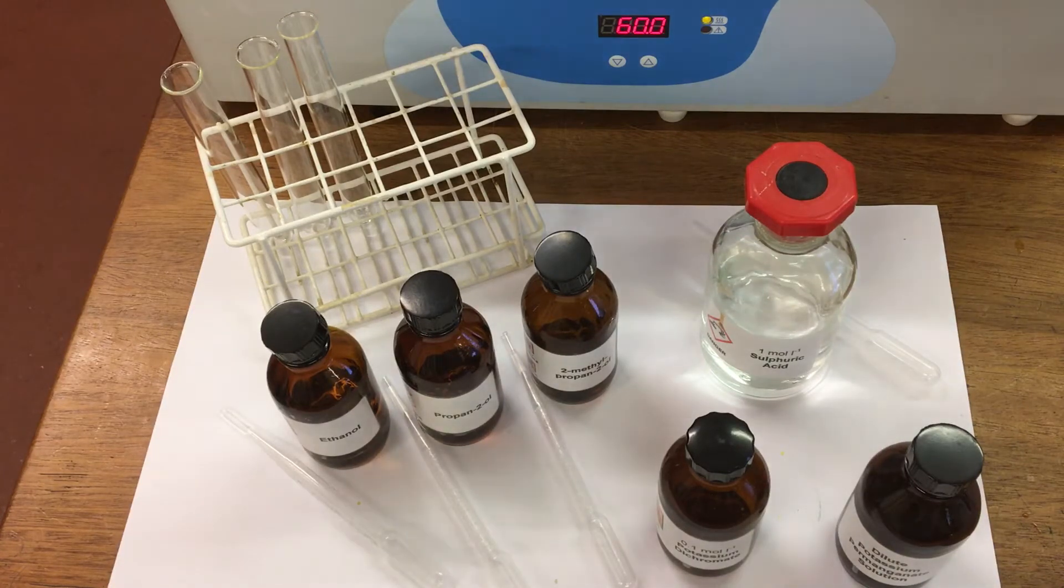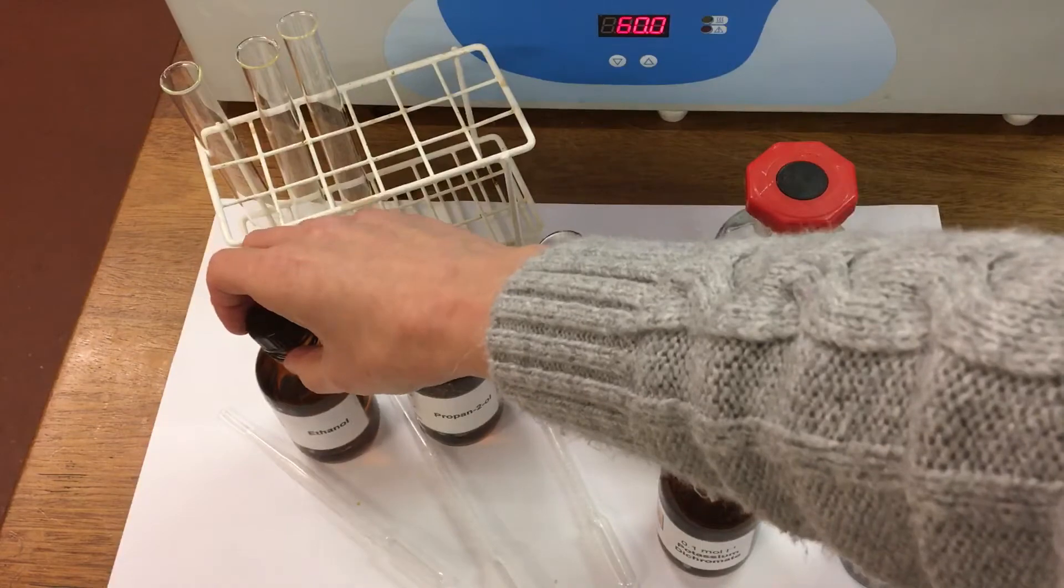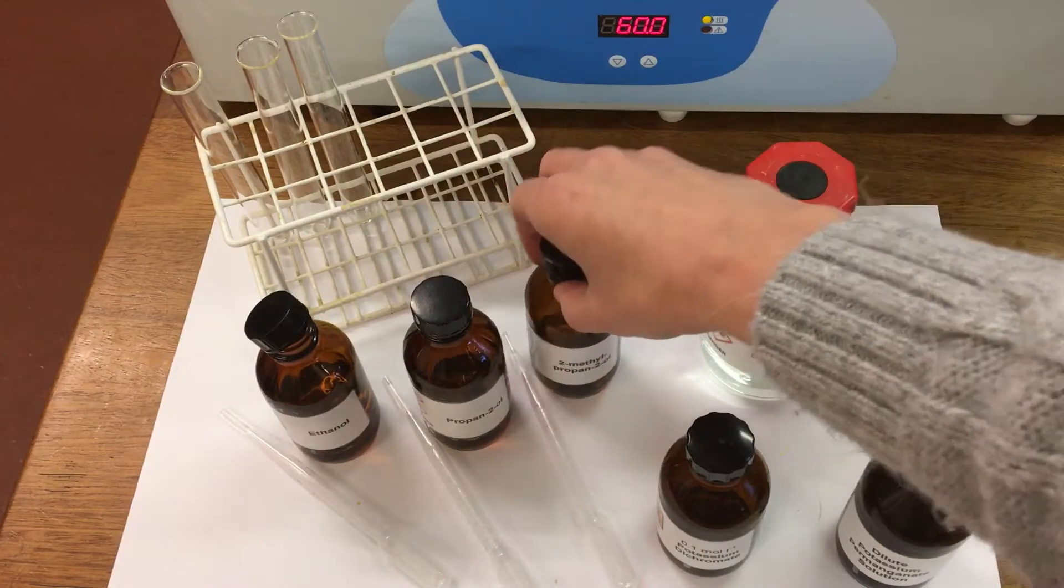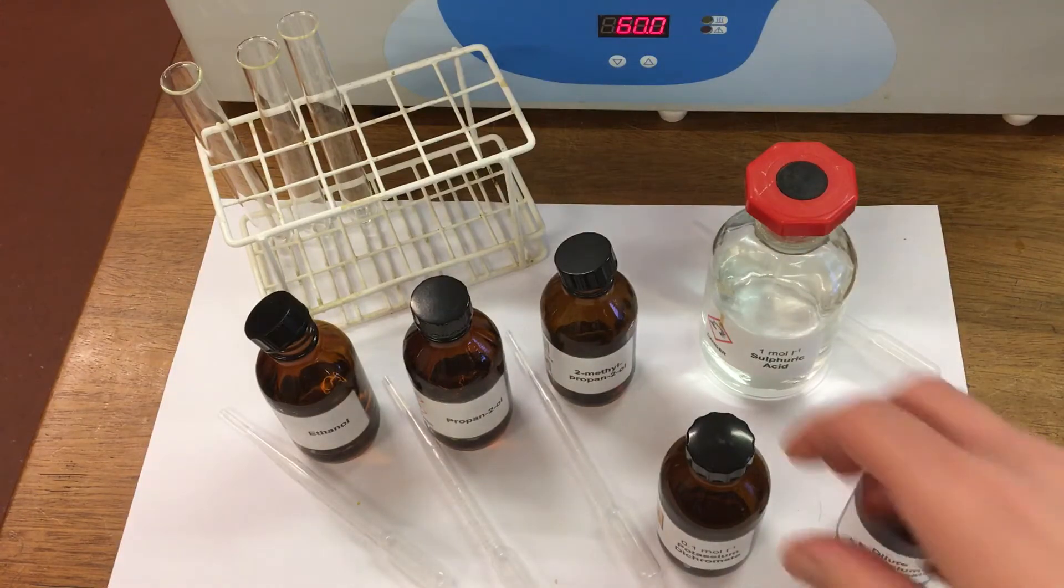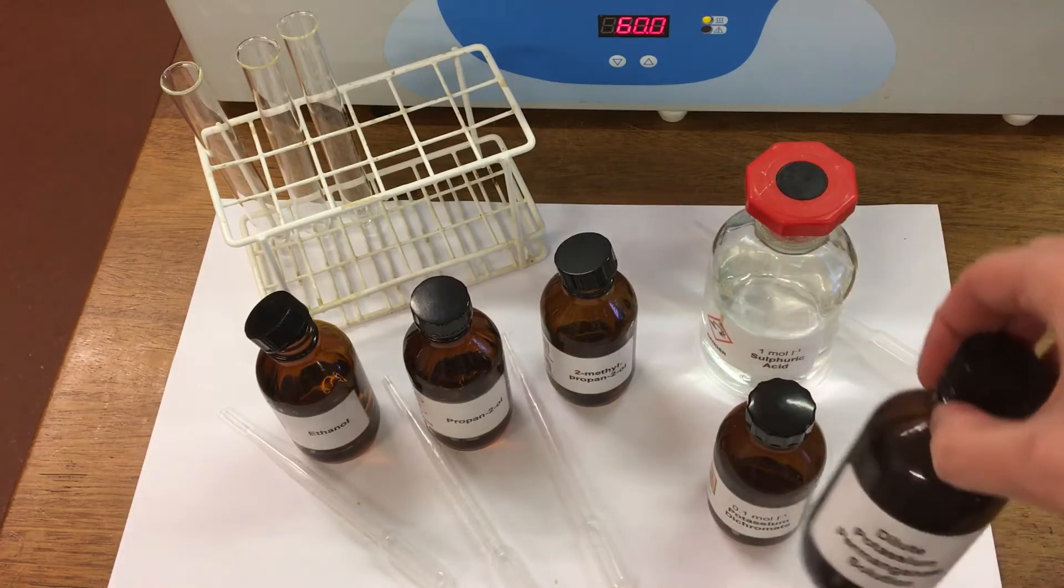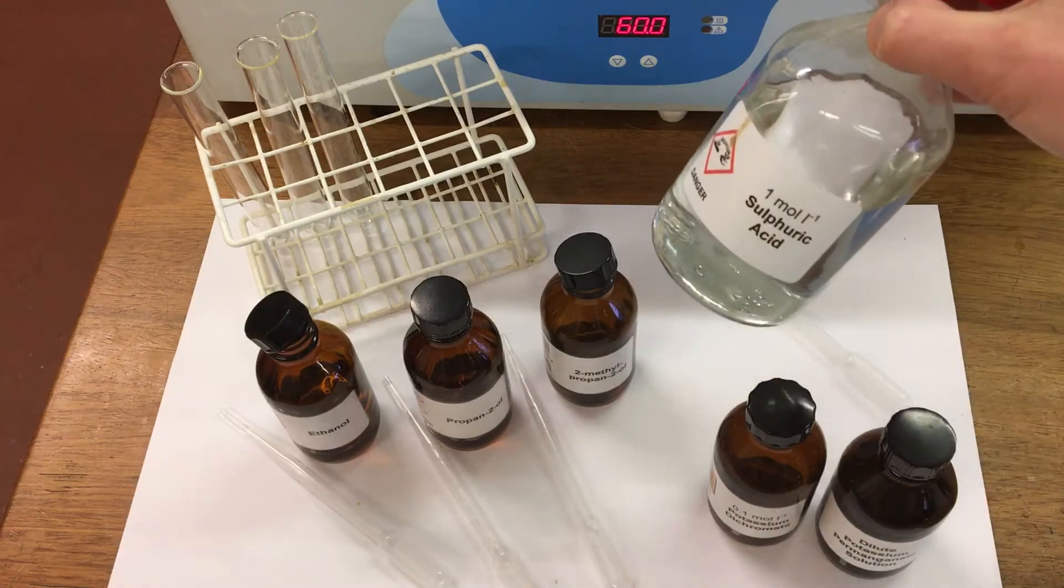In this experiment, we're looking at the oxidation of alcohols. I'm going to use three different alcohols - a primary, a secondary, and a tertiary - and two different oxidizing agents. I'm going to use ethanol, propan-2-ol, and 2-methylpropan-2-ol. Those are the three alcohols. Now we're going to use two different oxidizing agents: potassium dichromate and potassium permanganate, and both of these are going to be acidified with some sulfuric acid.